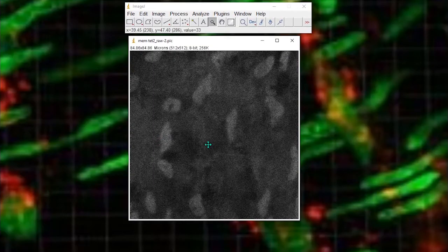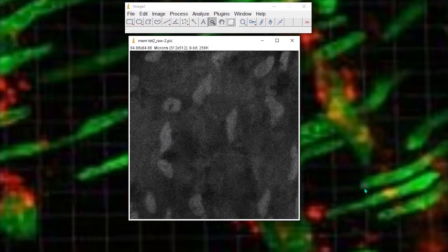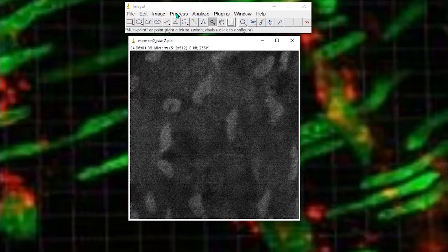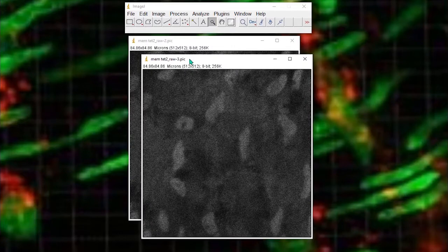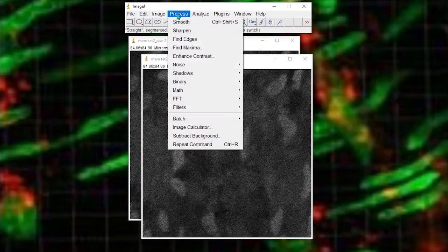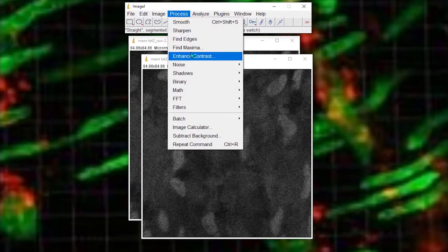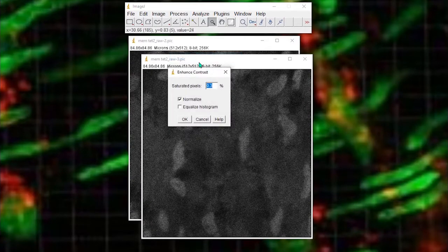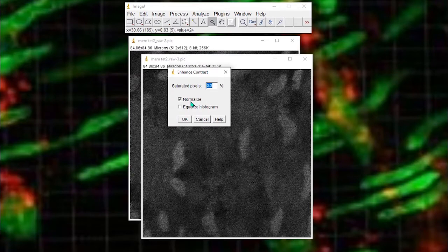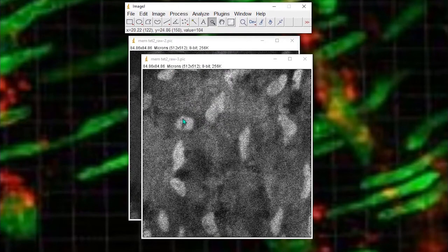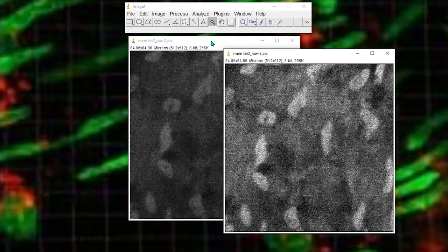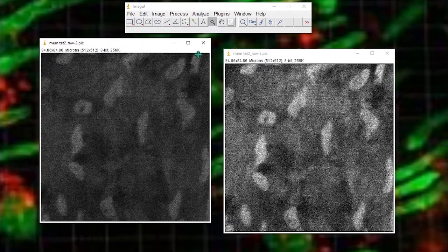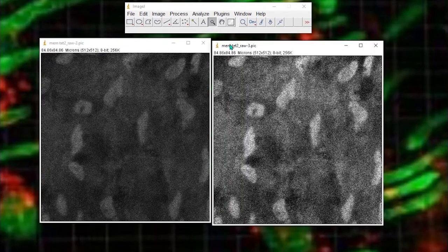Here's a fairly poor quality image. It doesn't matter what it is but you can see there are some objects in there. What we could do is enhance the contrast. Here's a copy of the image. Let me just enhance contrast and we'll do a normalize. We won't bother equalizing the histogram but it's not too bad. So that would work.